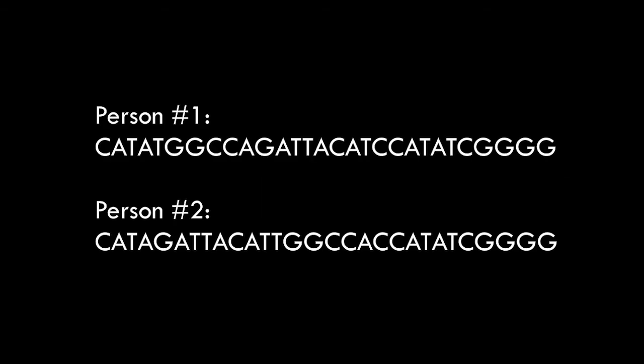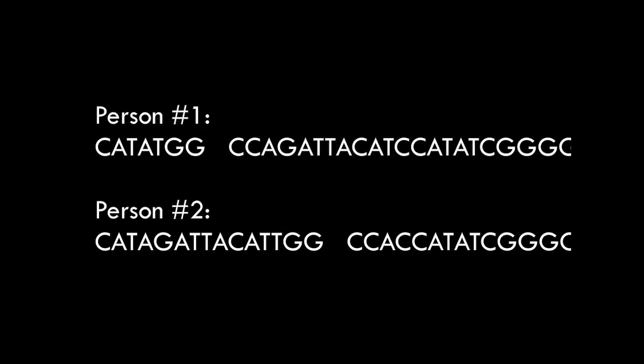Because each person has a different DNA sequence, restriction enzymes will cut each individual's DNA in different locations. This results in different sized fragments of DNA from each individual.